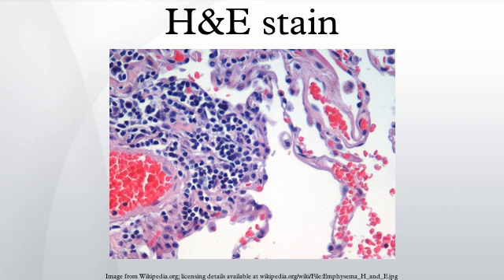Hematoxylin and eosin stain is one of the principal stains in histology. It is the most widely used stain in medical diagnosis and is often the gold standard. For example, when a pathologist looks at a biopsy of a suspected cancer, the histological section is likely to be stained with H&E and termed H&E section, H+E section, or HE section.